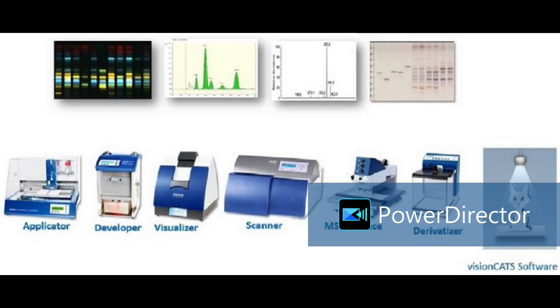You are talking about the degradation, decomposition. Yes. That will be stuck in that series. Yes. So in most forensic labs, these items are most of the time decomposed only. Probably that is the reason why you are not able to use that so effectively on those samples. Okay, that is a good question, ma'am. Last week I visited Patna FSL, Patna State Forensic Lab. They are also doing post-mortem samples.